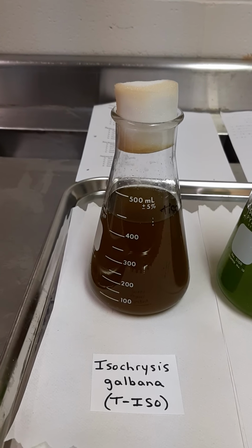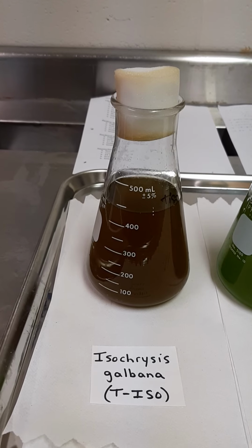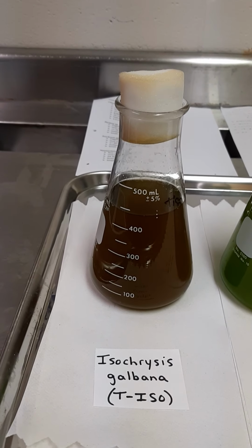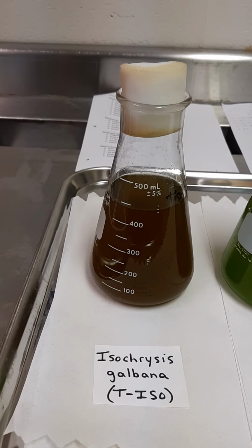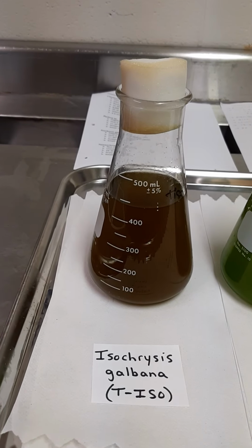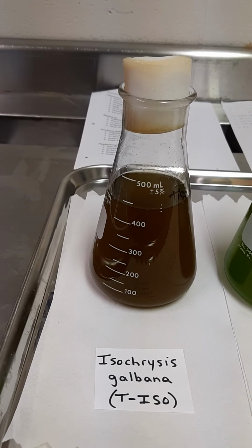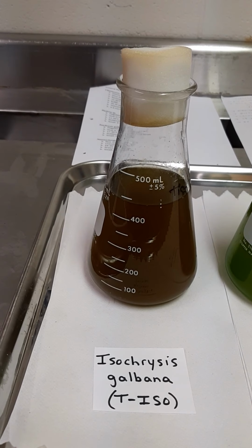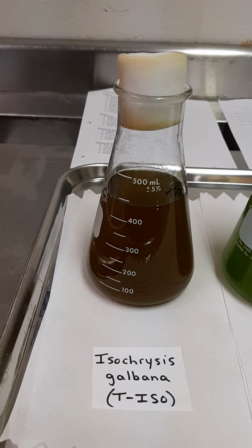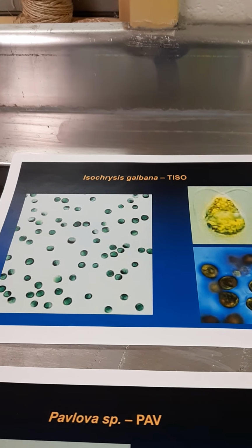So the first algae that I have to tell you about is Isochrysis galbana, which is the T-iso. It's a flagellate, so it's motile. It's oval in shape. It grows between 17 and 30 degrees Celsius. As you can tell, it's golden brown in color and it's very small, usually around 4.8 microns by 4.6 microns. Under the microscope, it would look like this picture right here.